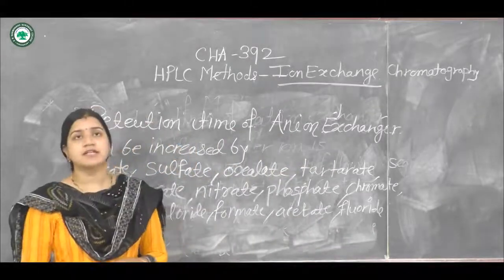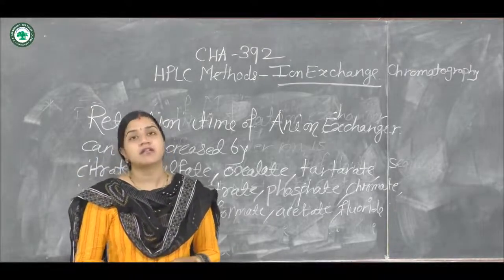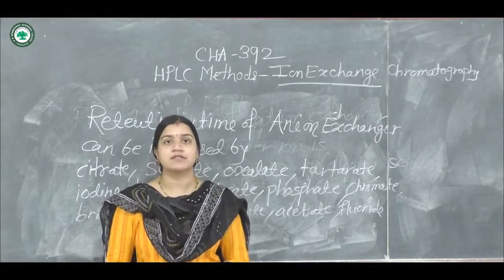Now after studying the sequence for the anion exchanger and the cation exchanger, the next important thing is what are the special possibilities of the ion exchange chromatography.